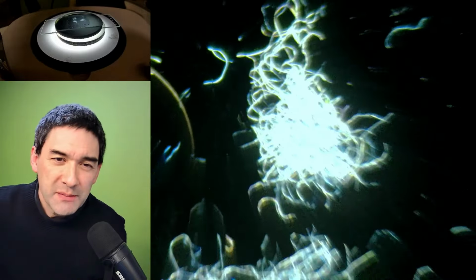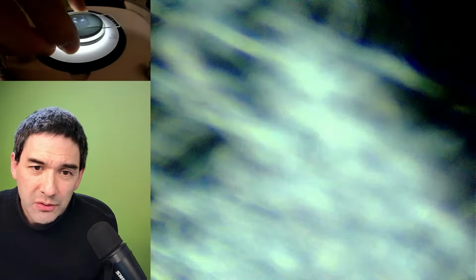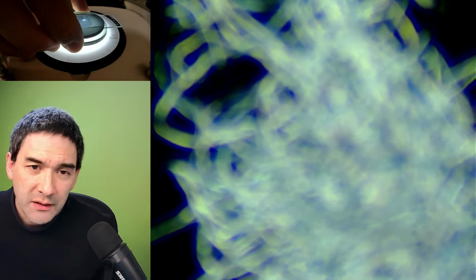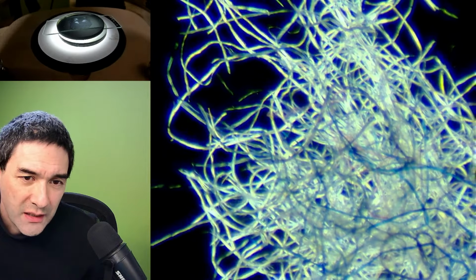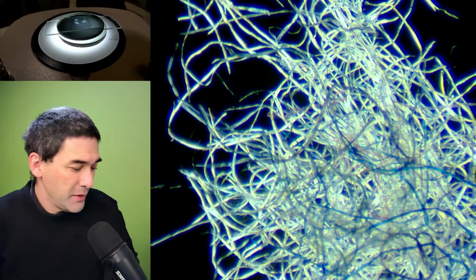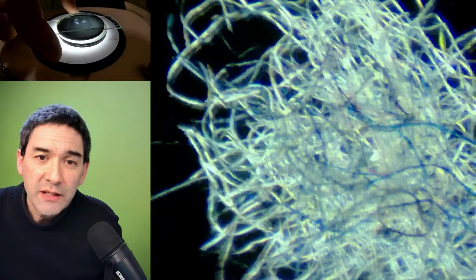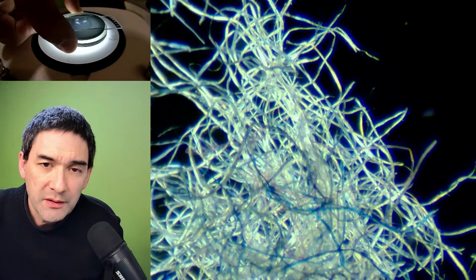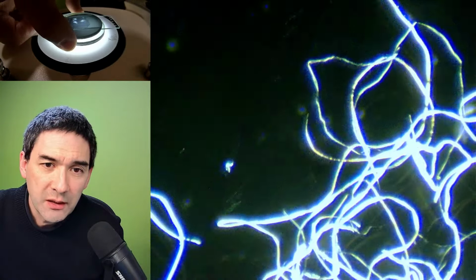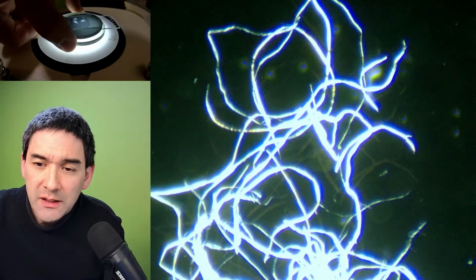It's a little bit overexposed now, so let's zoom in so that the camera is able to, and then I'm going to refocus again, and this is how it looks. So now you also know how I got the thumbnail image. That is one of the nice things here, and I'll also be using the stereo microscope to test a couple of fibers, whether they're natural or synthetic.